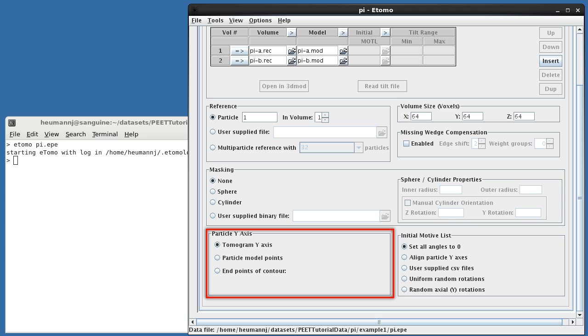Scrolling down to the bottom of the Setup tab, we can determine how the particles' y-axes are determined. PEAT uses two coordinate systems. Translations are specified in tomogram x, y, and z coordinates, with z being the vertical or slice direction, and y the tilt axis.